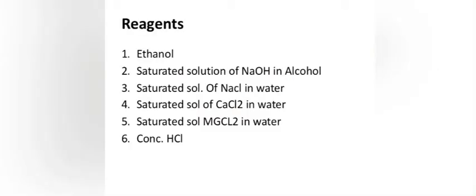In this video, we will demonstrate the effect of various salts and acidity on the solubility of soap. The reagents which are used are ethanol, saturated solution of NaOH in alcohol, saturated solution of NaCl in water, saturated solution of CaCl2 in water, saturated solution of magnesium chloride in water, and concentrated hydrogen chloride.